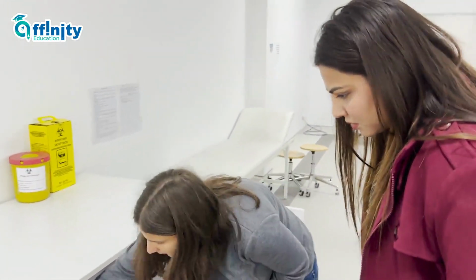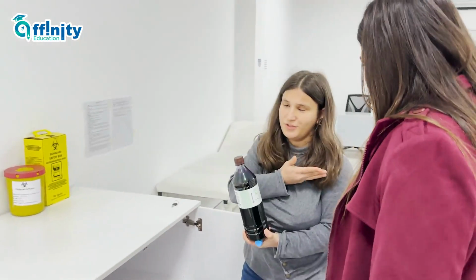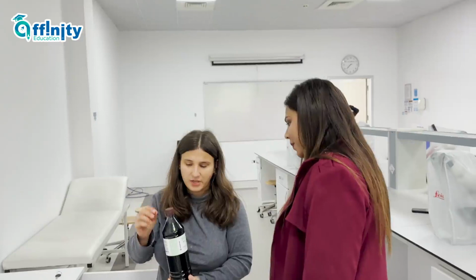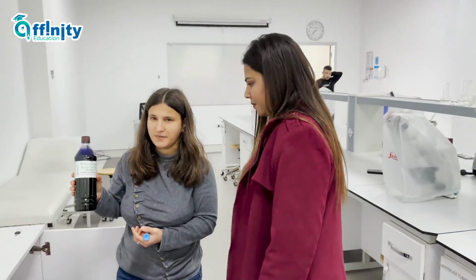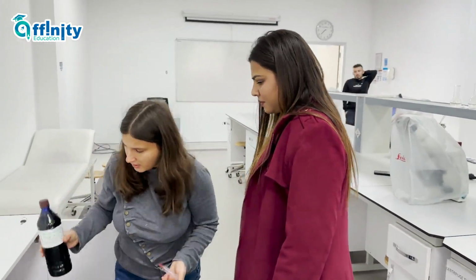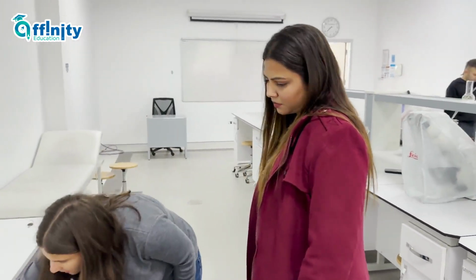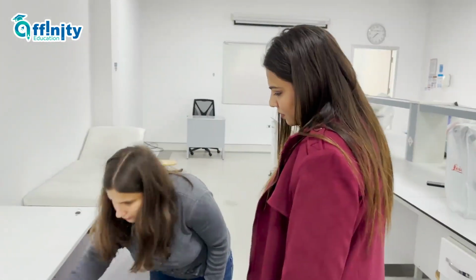This is for, if I showed you this one. Microbes are not visible just if we look at them. We need special stains. This is stains for staining these microbes. And this is for staining. Taking blood.